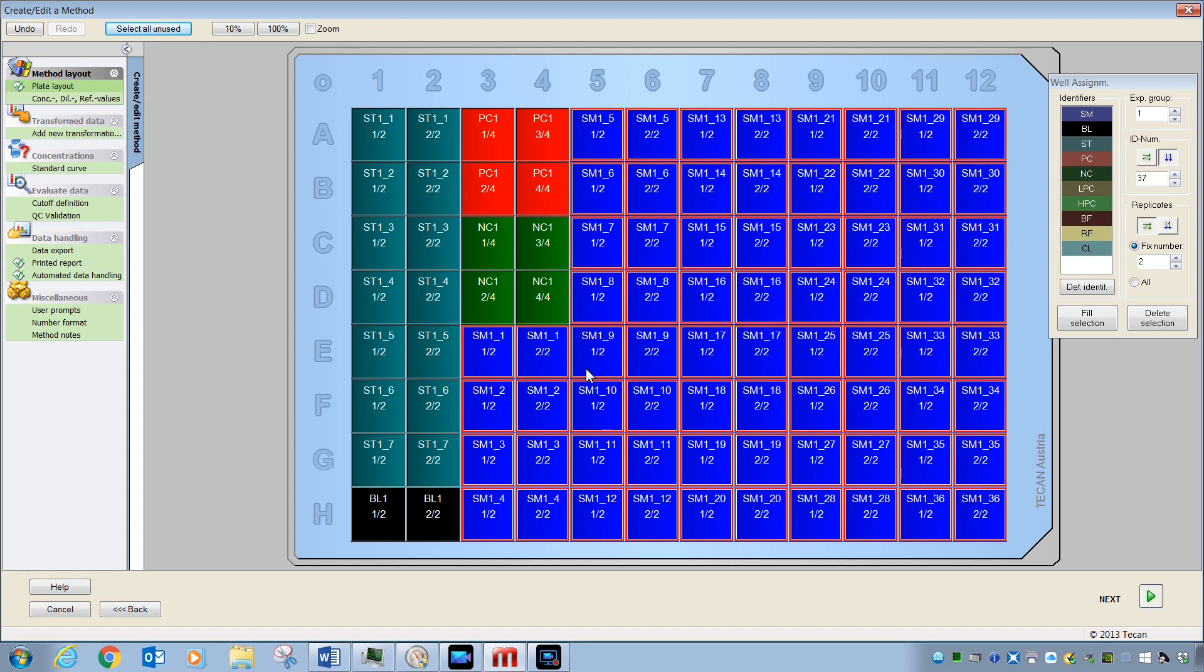Once you have your plate layout, the next step will be to move through a variety of these different additional parameters and make changes where necessary. Some of these steps are more important than others. And you should know that at this point, with a plate layout, you could go to Next and simply read your plate and come back and enter the information for these other steps later.